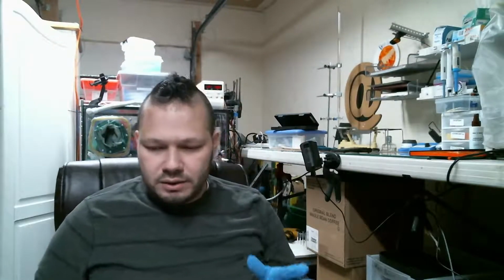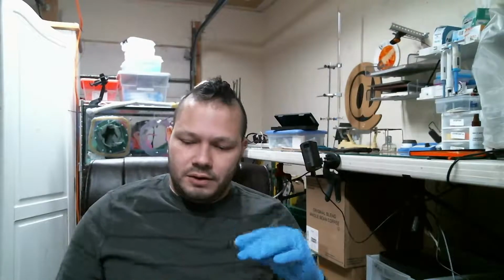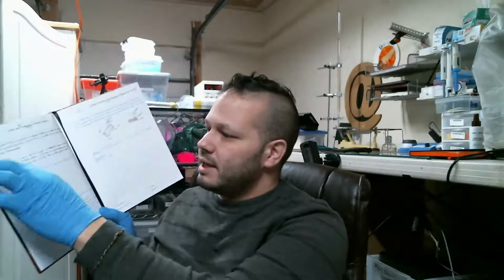I just wanted to get on here real quick to explain how I plan a lab activity, whether it's an experiment or anything like that. Beforehand, I go into my laboratory notebook, which you can see right here, and I meticulously plan out everything. First I write a little purpose, essentially explaining the reason why I'm doing this. And then I go into the actual methods of how to do it. Depending on the situation, sometimes things can change, in which case I'll just note that I didn't do this step or that step, or I had to change something.